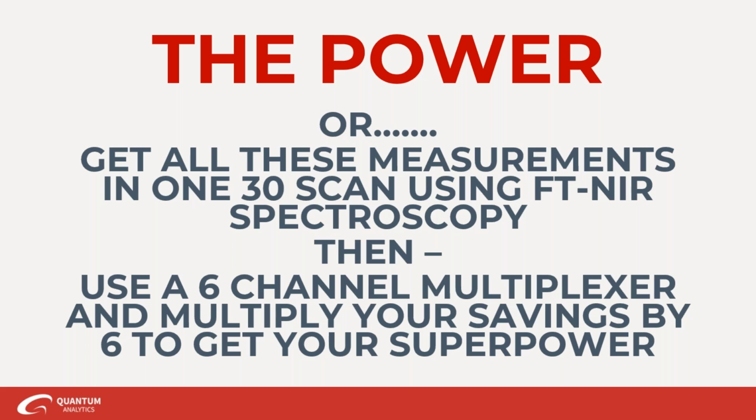So, there's no magic formula that, hey, you need this many samples for this particular measurement. If it's something simple in a controlled environment, and you've got a tight range between the specs, and it doesn't really go out of that too much, then you probably don't need that many.